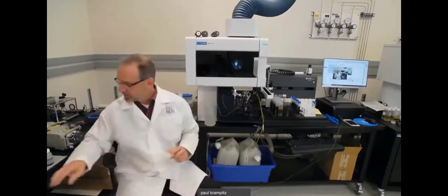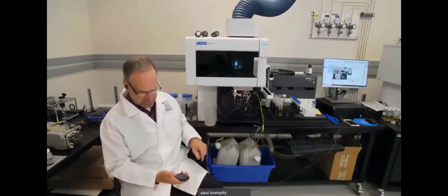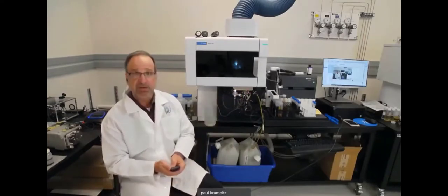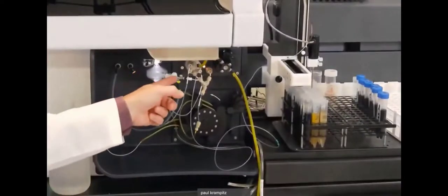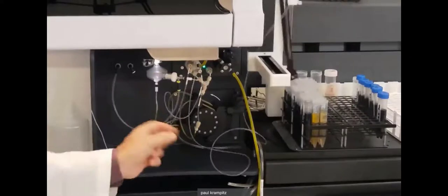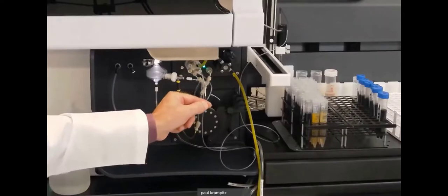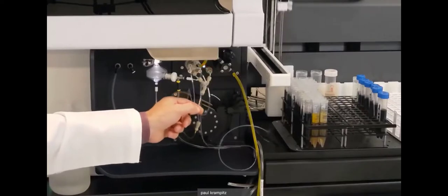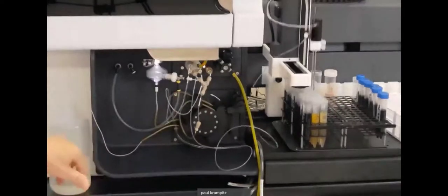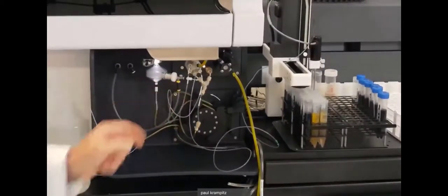And what we're also seeing here, which is kind of neat, is you're seeing the valve right here. I'm going to zoom in just a little bit here, see if I can make this work. Okay, so this is a little bit better look of what we're actually doing here. You can see here's the spray chamber. Here's the nebulizer. This right here is the valve. And I uncoiled this loop right here so that you could see it a little bit better. This right here is a half mil loop. So we're filling up this loop with the sample, and then we're using this carrier after the valve switches to push what's in this loop up into the spray chamber.